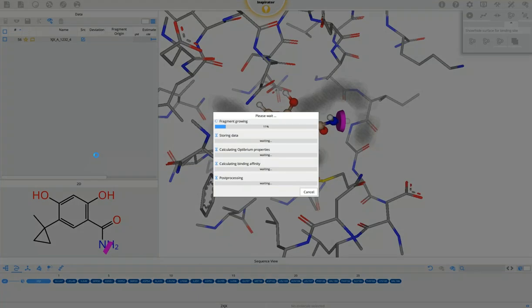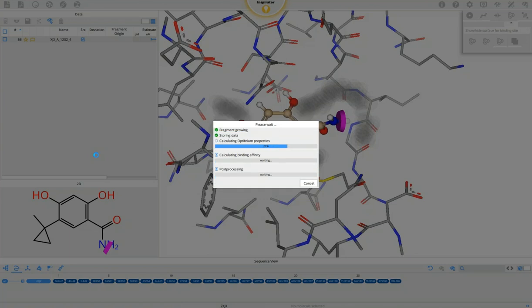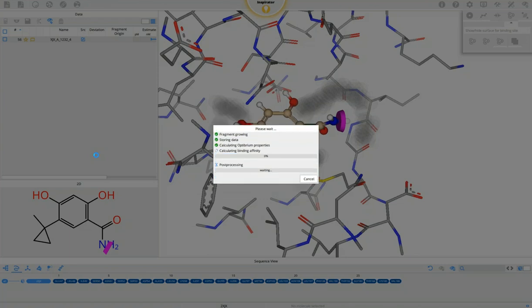And what happens now is that SeeSAR runs through a database of little fragments to which linkers are attached and starts building them all together with the growing start fragment that I've used here, which you see on the left side. The protein in this case is a sphere around all that and is a kind of exclusion volume. So nothing will survive that would clash with the protein.